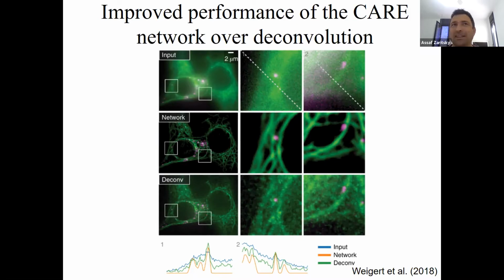But the intuition is, you know, once you see that, maybe for me it's already, it's 2.5 years, even more actually, 3 years that the field knows that these things are possible. So for me, it's already trivial. But yeah, it's surprising because by intuition you would think that knowing the specific properties of the specific microscope or whatever you use for your image and using this information should be better than not knowing that.